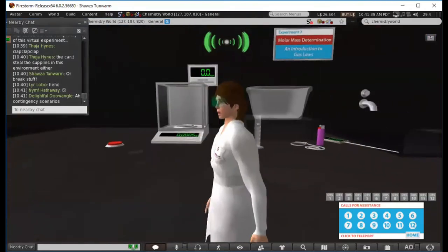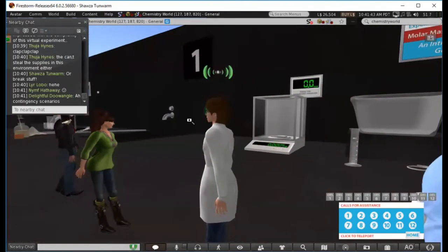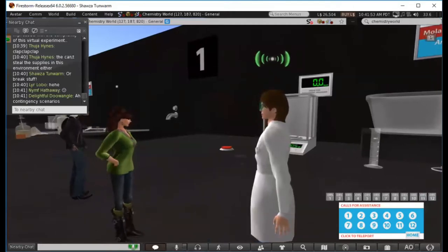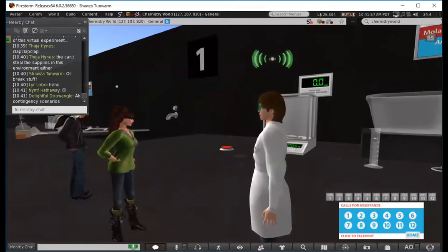When you have the power to design the lab environment from scratch, there's a lot more things to consider. And so you can make it super authentic with all the hassles of a normal lab, or you can have a little bit of convenience thrown in.